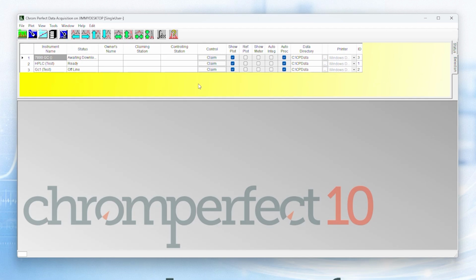Before we go any further, you should remember from our last lesson that each instrument which is to acquire data must first be claimed by the user. Do this by clicking the Claim button on the Selection tab. You will see the button change from Claim to Release. The spreadsheet cells for owner's name, claiming station, and controlling station will also be populated. This indicates that the instrument has been successfully claimed and is ready to acquire data. Now we're ready. Let's have a closer look at the two tabs in the Run program.